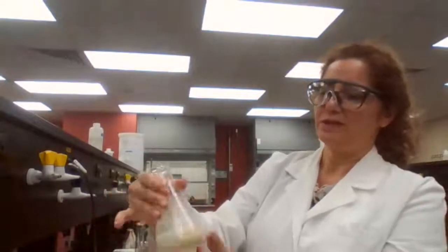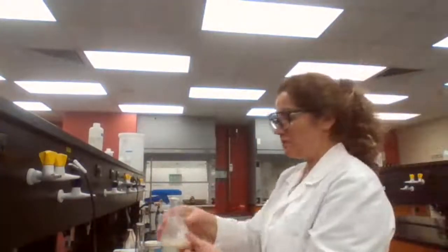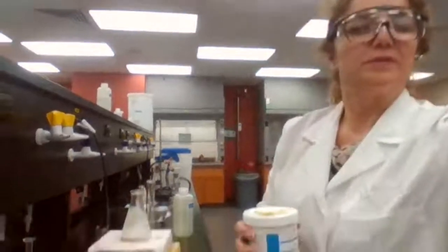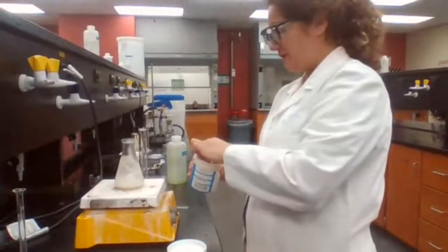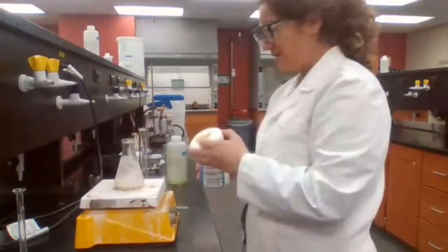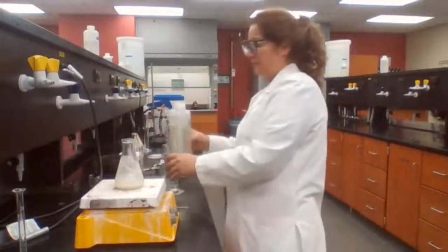Because I'm trying to boil this, I'm going to have to add boiling chips, the same reason we add boiling chips to the boiling flask in distillation. We use boiling chips any time we are boiling a liquid to avoid bumping. Just make sure you see the setup. I'm going to add the boiling chips, and I remove them later mechanically, so I don't have to filter. Add 100 mL of water.